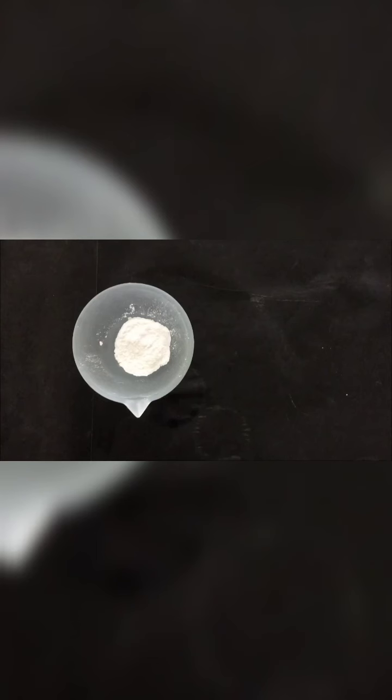Welcome to the channel Solution. In this video, we will show you the procedure for preparation of TLC plates. TLC plates means thin layer chromatography plate of which one side is coated with adsorbent. The most common adsorbents are silica and alumina. Here we have taken silica gel G as adsorbent.